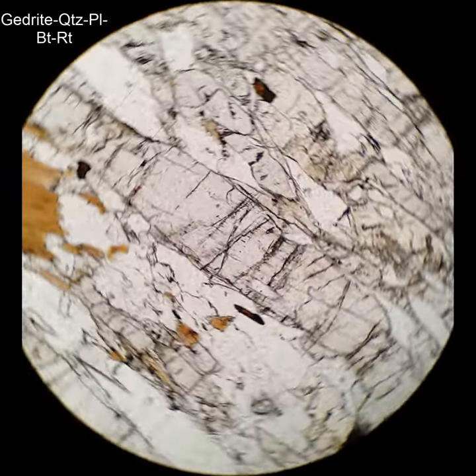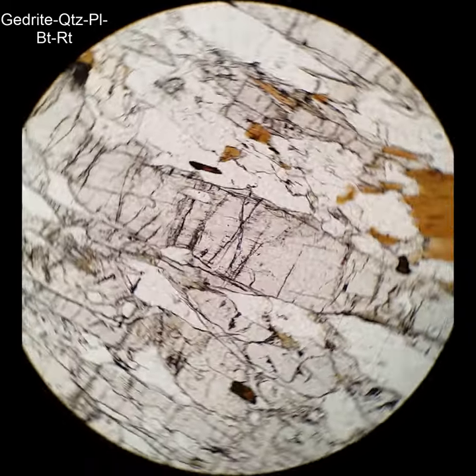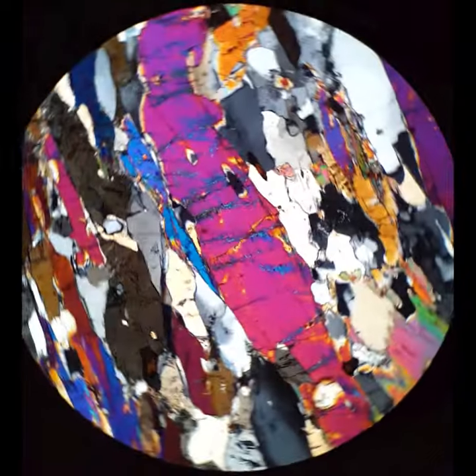This is another grain of gedrite. Very, very pale pleochroism — I can just barely make it out. But it's got the moderate relief, parallel extinction — you'll see that when I cross the polars. In this case, the interference colors are about as high as I ever see, those really intense reds and purples and magentas.